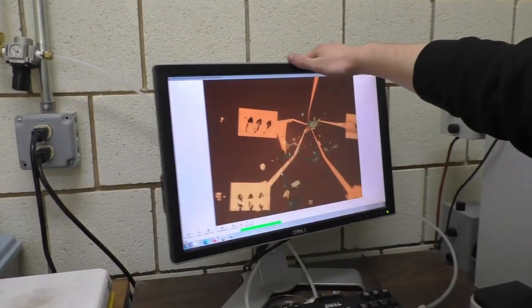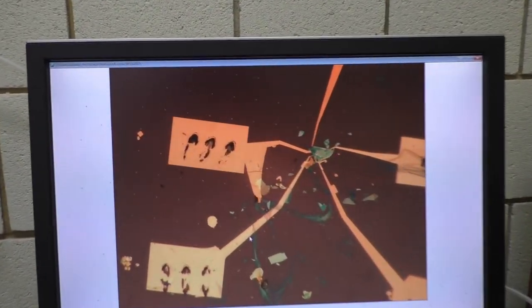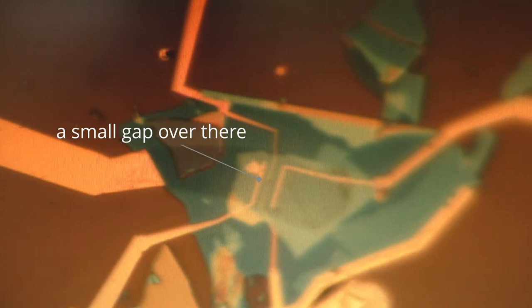If we place the sample under an optical microscope, we can see much more detail, down to the micrometer-wide electrodes connected to a tiny 2D crystal. But below one micrometer, things we would like to see become very fuzzy.